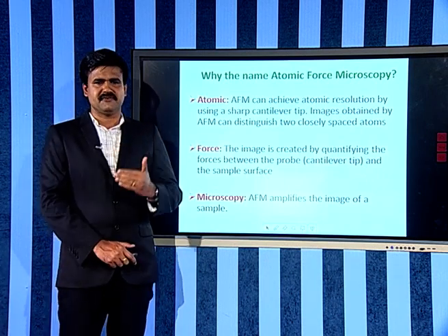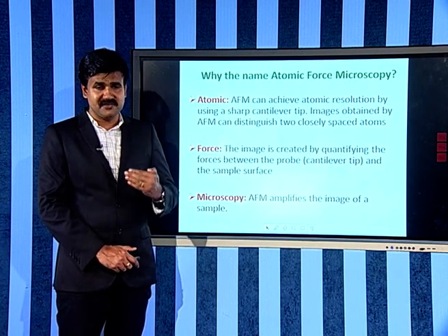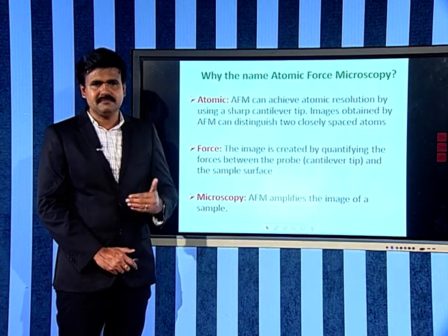Microscopy. AFM amplifies the images. The instrument which is used for amplification is a microscope. Hence, the term microscopy.